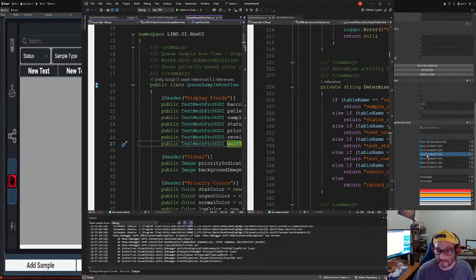If you make a mistake, it's fine. Just go back. That's why you have all this abstraction. You know that is to save you. Sometimes let's just go 3, 1, 2, 3, 4. There we go. 4. Okay.